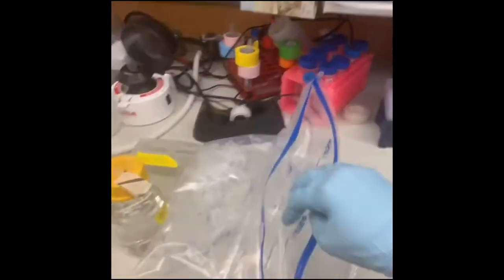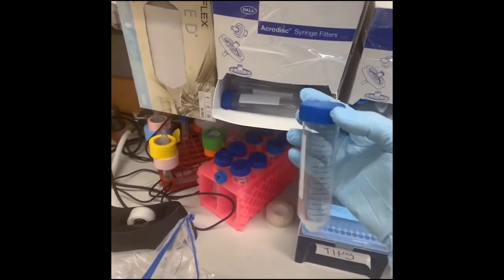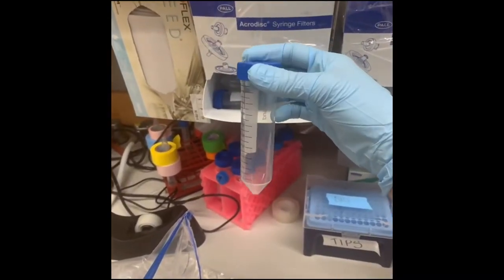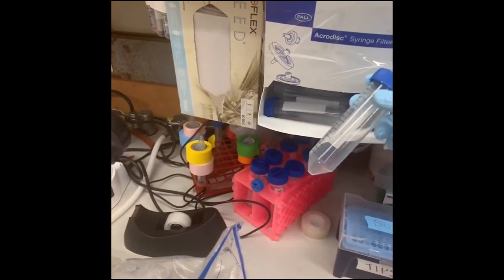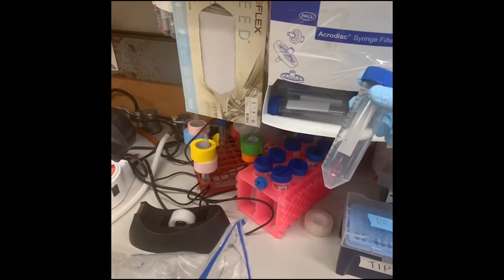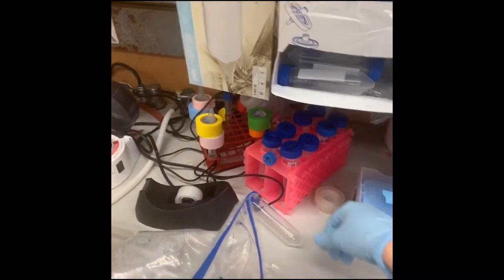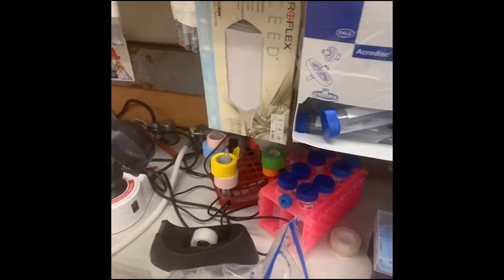Now we can talk about tubes. These are falcon tubes — Falcon is a brand name but everyone just calls them falcon tubes. They have a conical bottom which makes them good for centrifuging, but bad for when you want to hold them up because they just fall down, so we have racks which can hold them. This is a 50 milliliter and this is a 15.